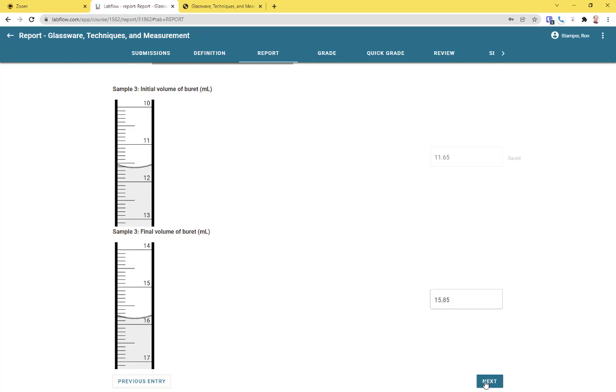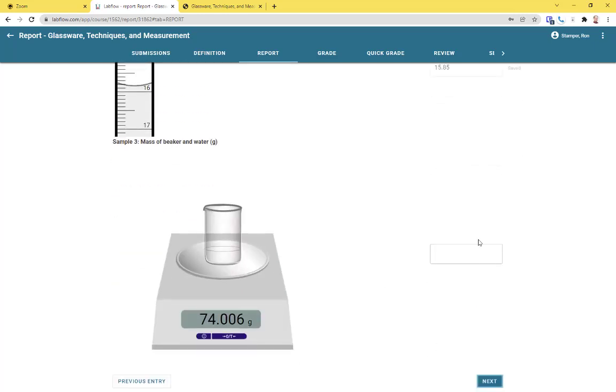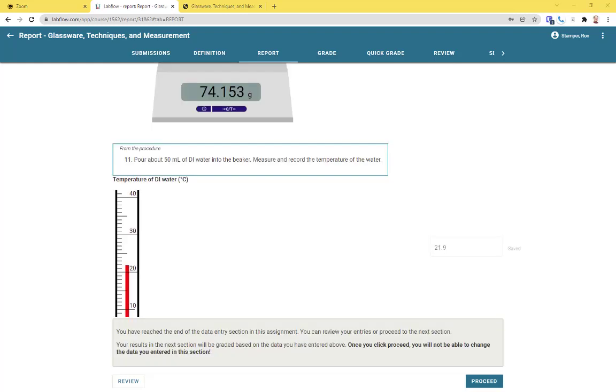15.85. Unfortunately, in LabFlow, I can't skip this and do my demonstration. So bear with me as I go through this. Actually, I'm going to pause the video and I will check back in just a moment.